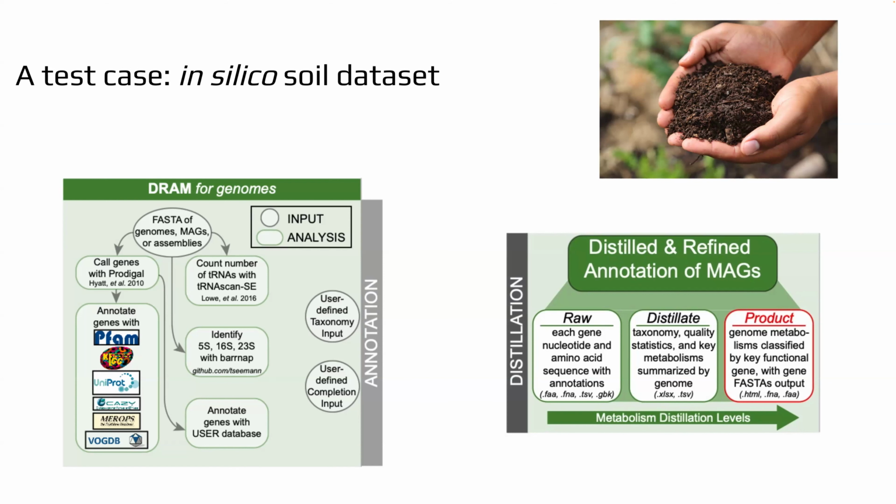And the product is the heat map that we're gonna really walk through today. It's that really user-friendly, quick thing to scan. So we're gonna go step by step of how to work through the product. Please, the next. Thank you, cool.